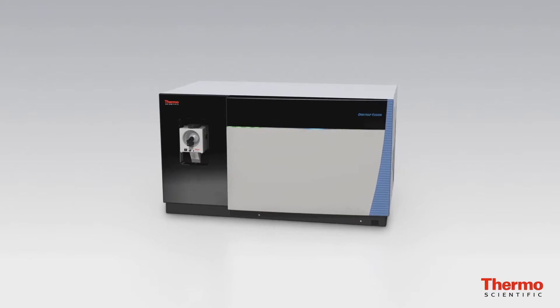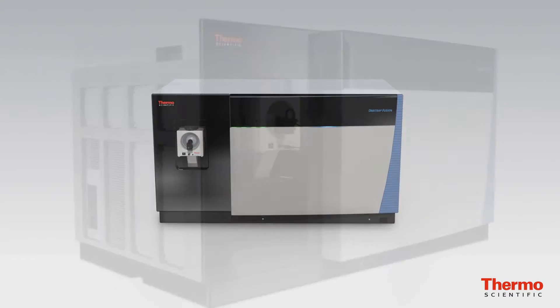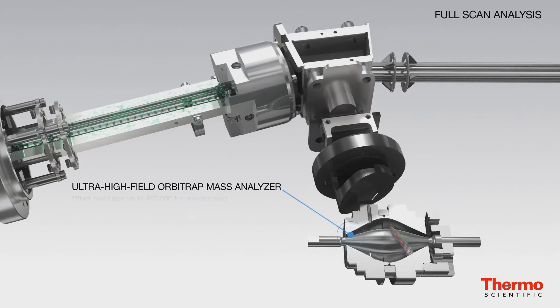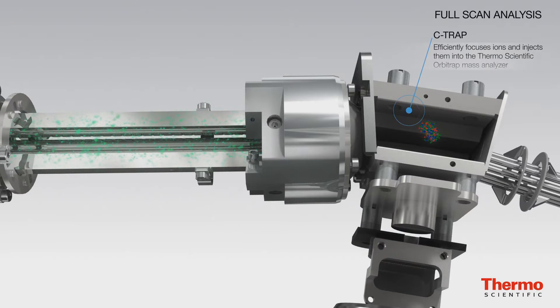The Orbitrap Fusion is a really unique system. It combines three different mass analyzers: a quadrupole, an Orbitrap, and an IonTrap. That combination of three mass analyzers allows incredible parallelization of analysis, which allows incredible speed in analysis of complex samples.